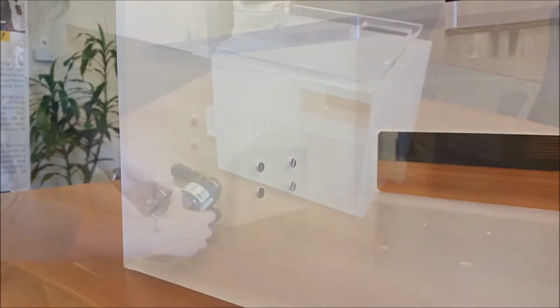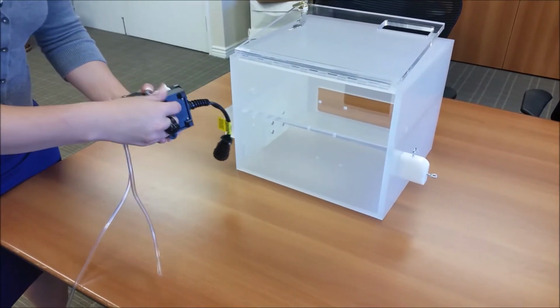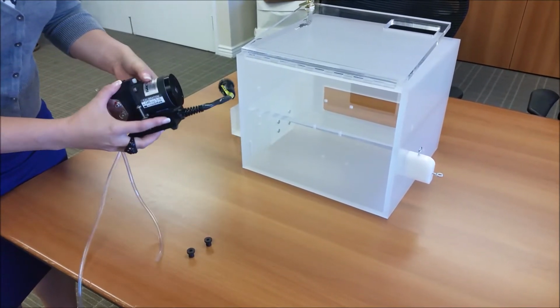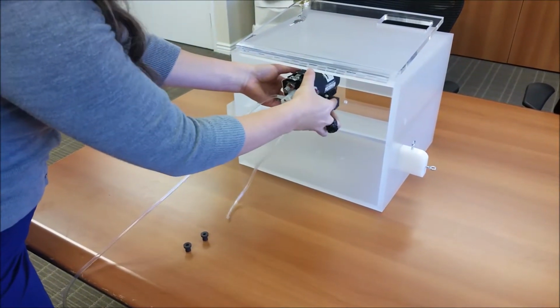After fastening all 4 screws, we will install the pump. Start by removing the 2 rubber screws under the pump and carefully slide the pump in the second level of the acrylic box. The boxes have been designed to take up the least amount of space on your counter, so the pump will fit with very little clearance.